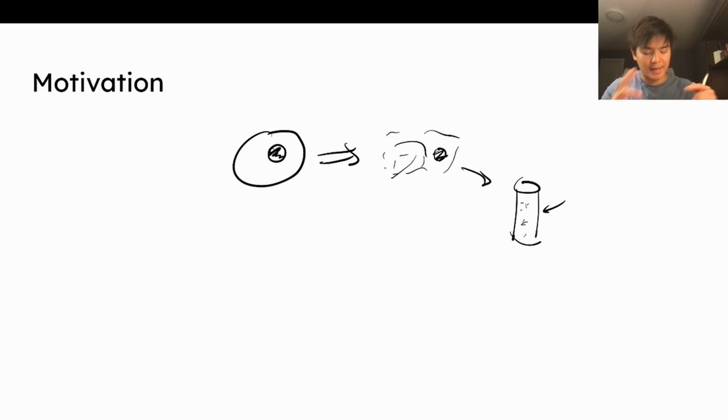It'll let us take this vial, which is a bunch of proteins, and sort them based on some sort of property that we want them sorted by. And you can imagine how important this is, because we can't really just go in there and pick up proteins ourselves. We have to do it through their properties.